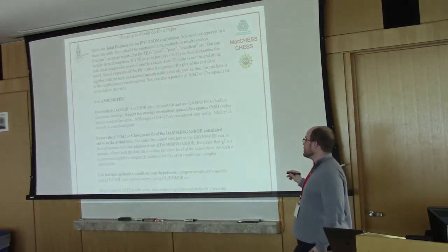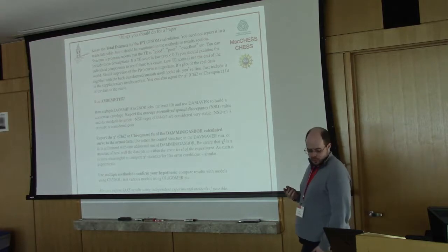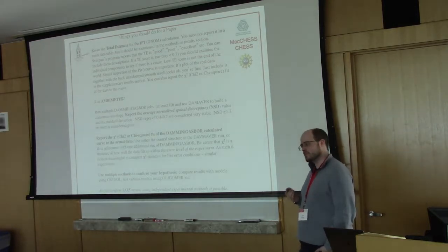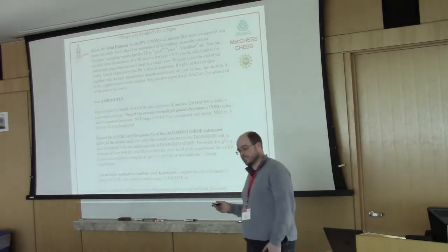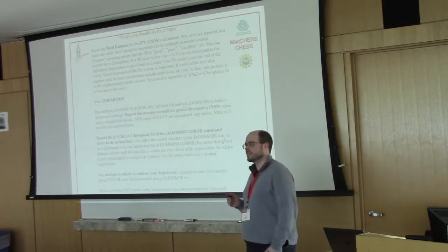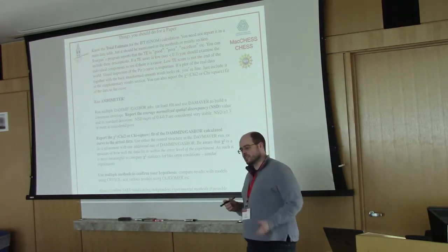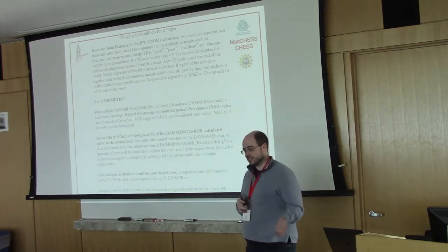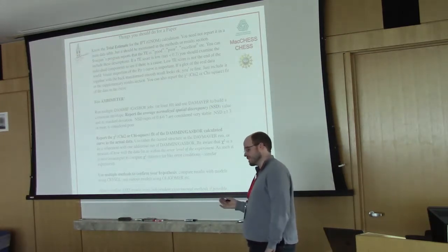This is a key point, though. Use multiple methods to confirm your hypotheses, right? What I want to add is that SAXS is really best when you're model testing. You build a model and you test it against the data set. Building envelopes is fun. It makes lovely pictures for your PI or your presentation, but it's usually not as useful as doing rigid body modeling and testing it against the data, or whatever it is you're interested in. That tends to be a much more accurate way of determining whether or not something is real.